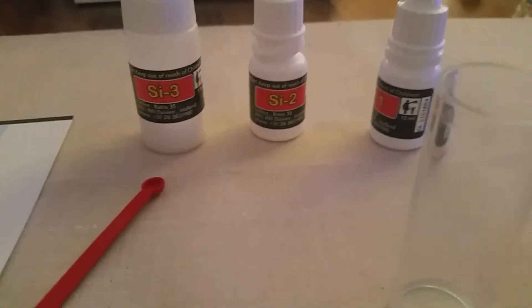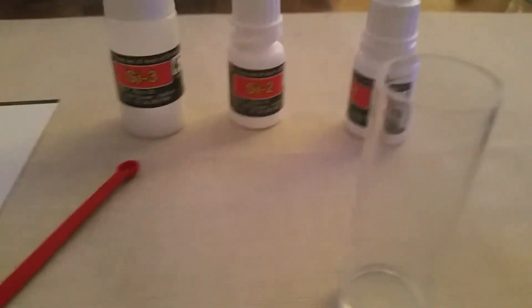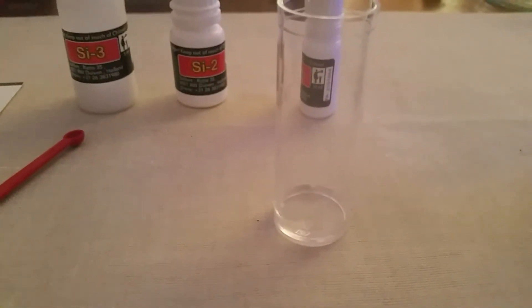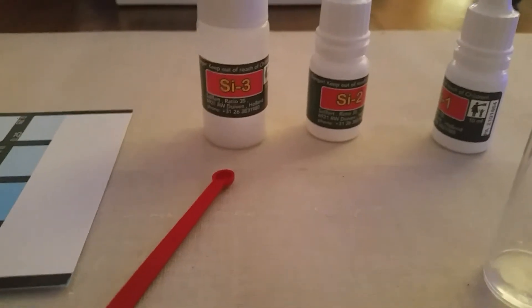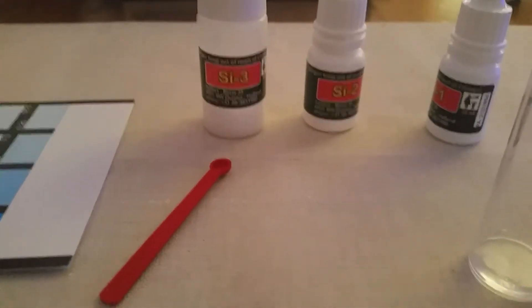That's five minutes done, so now I'll add SI2 — four drops again — and wait for one minute.